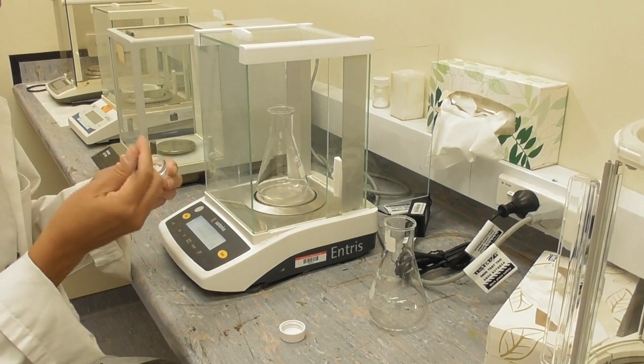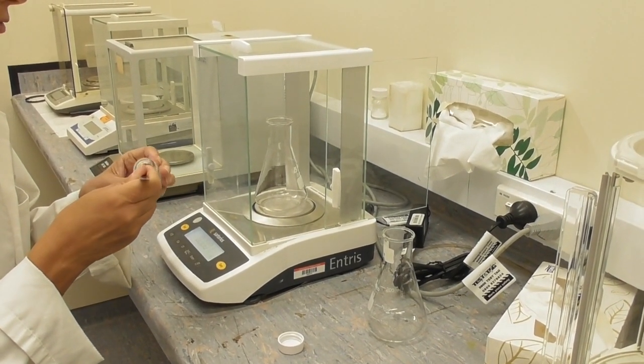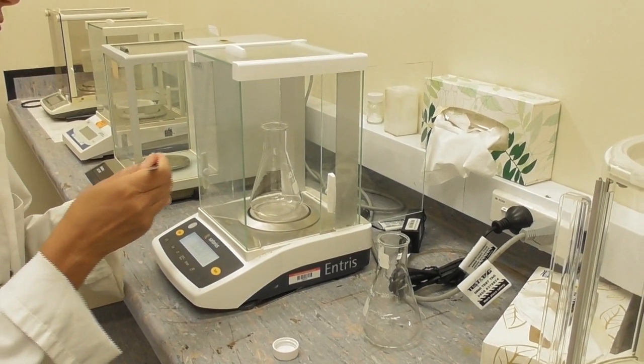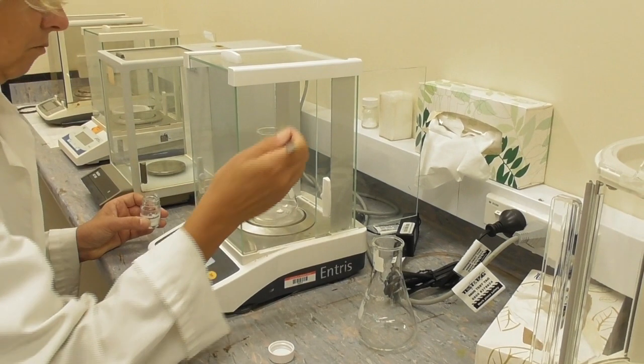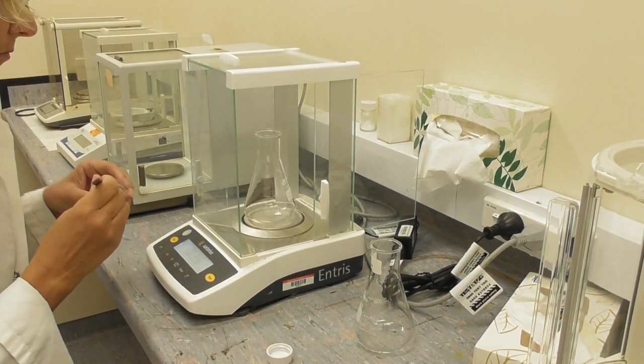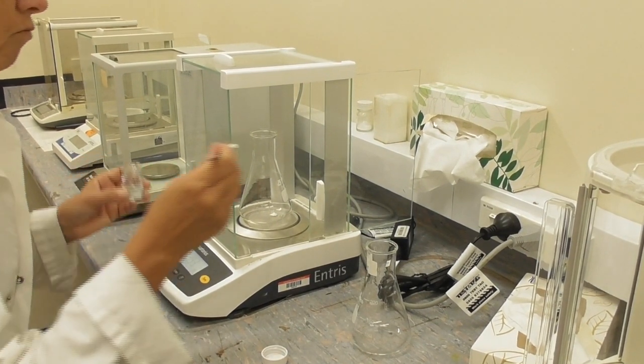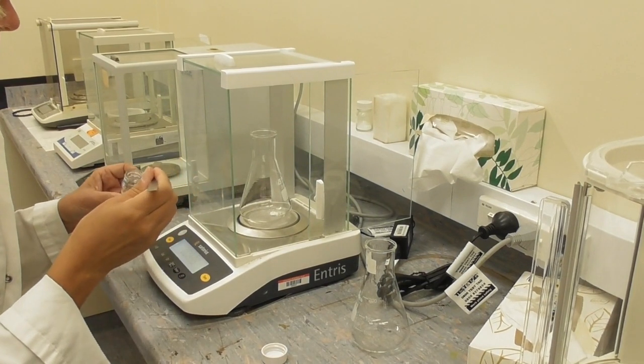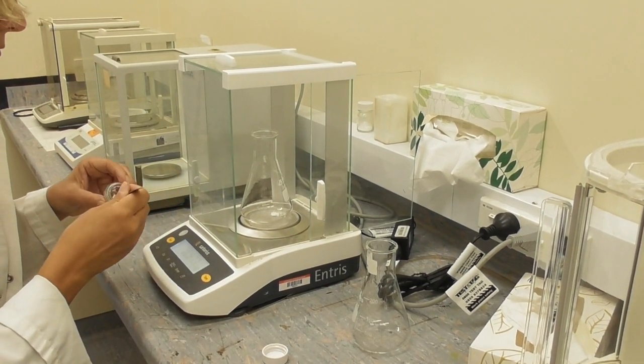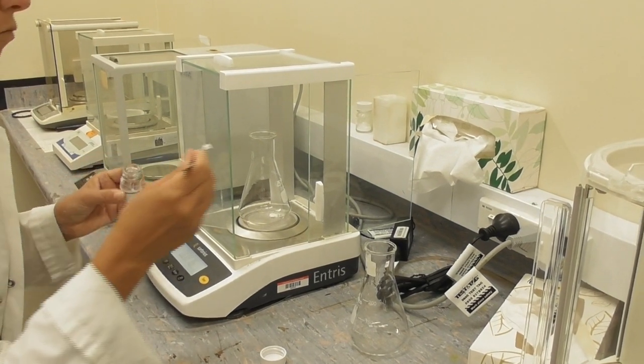I add peroxyborate into the flask. While it says approximately 0.2 grams, it doesn't really matter what it is exactly as long as I write down the mass of peroxyborate that is in my flask.